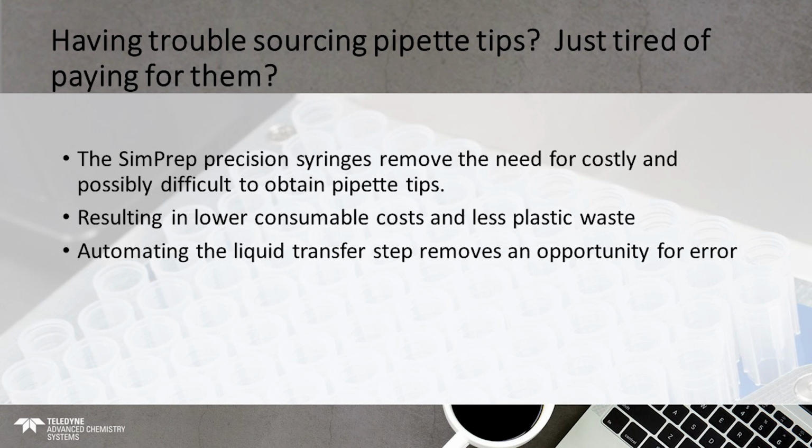need for them. In places like biochemistry where I studied, we couldn't begin to use something like SimPrep because we were concerned about DNA level contamination. But for most analytical work, the rinse that you get from the sample probe is more than sufficient for what you need. And thus the carryover numbers that we looked at earlier, right?